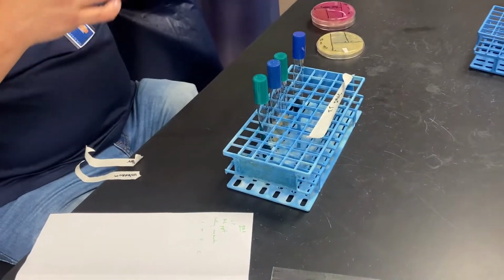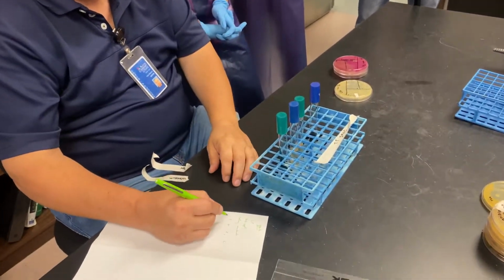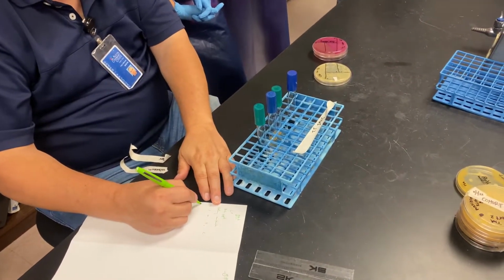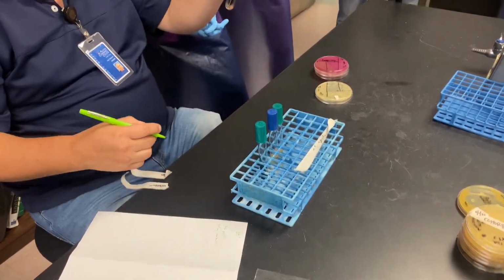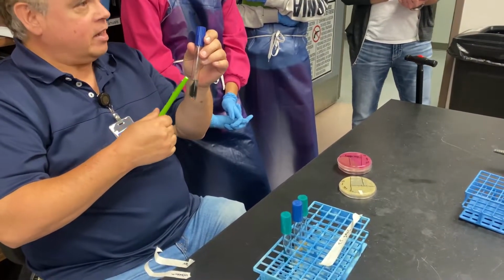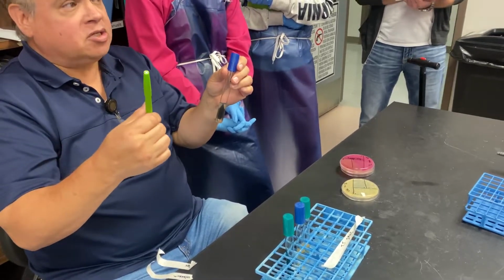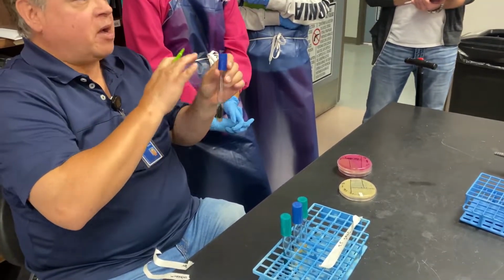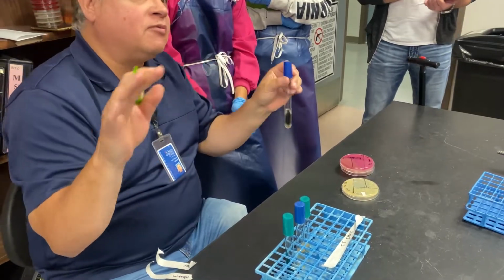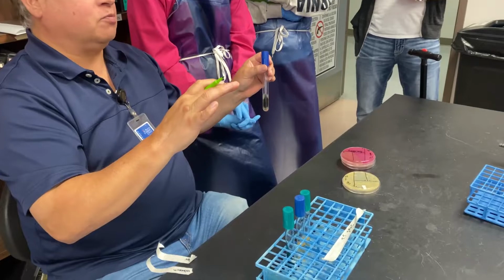So now I'm going to look at these, and what I can tell here is that in my SIM, I have positive hydrogen sulfide, but I don't know whether it's indole positive, and I don't know if it's motile. Now remember, for the practical, we said if it's H2S positive, we're just going to call it motile, so we didn't have to argue whether it was motile or non-motile. Now you have to figure out if it's motile or non-motile.